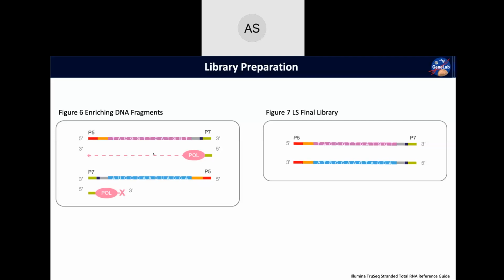Okay, great. We're going to talk a little more about duplicates later during the analysis or evaluation of our sequencing data, so we'll revisit that concept. Any other questions about library preparation before we move on to evaluating our libraries?